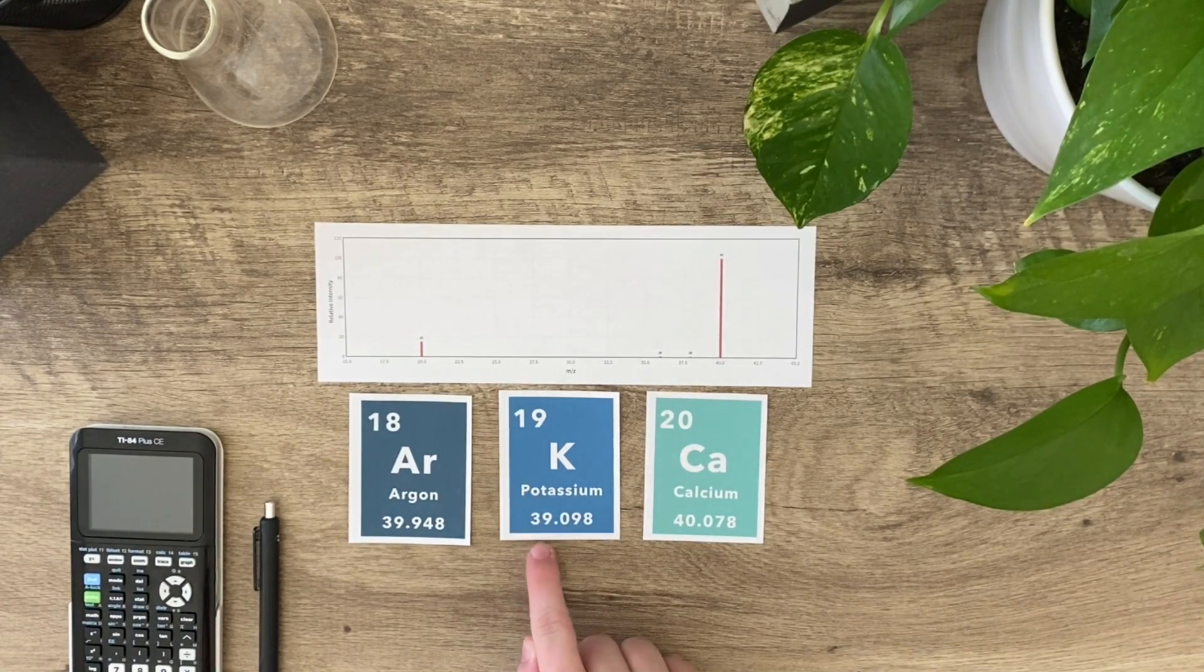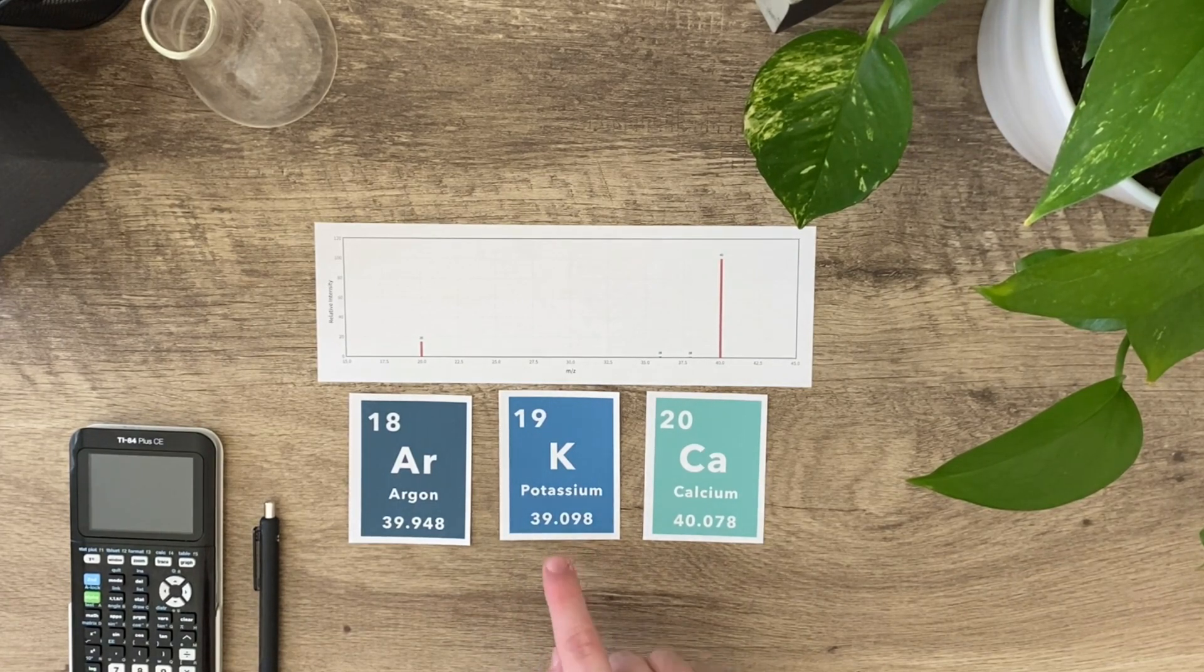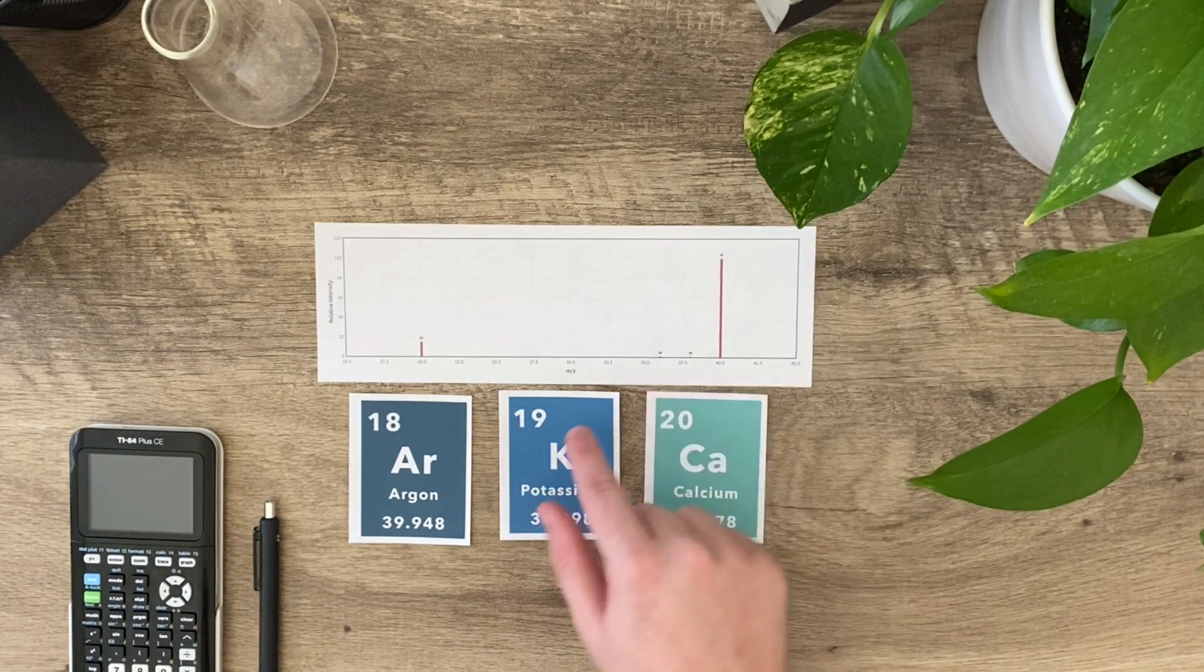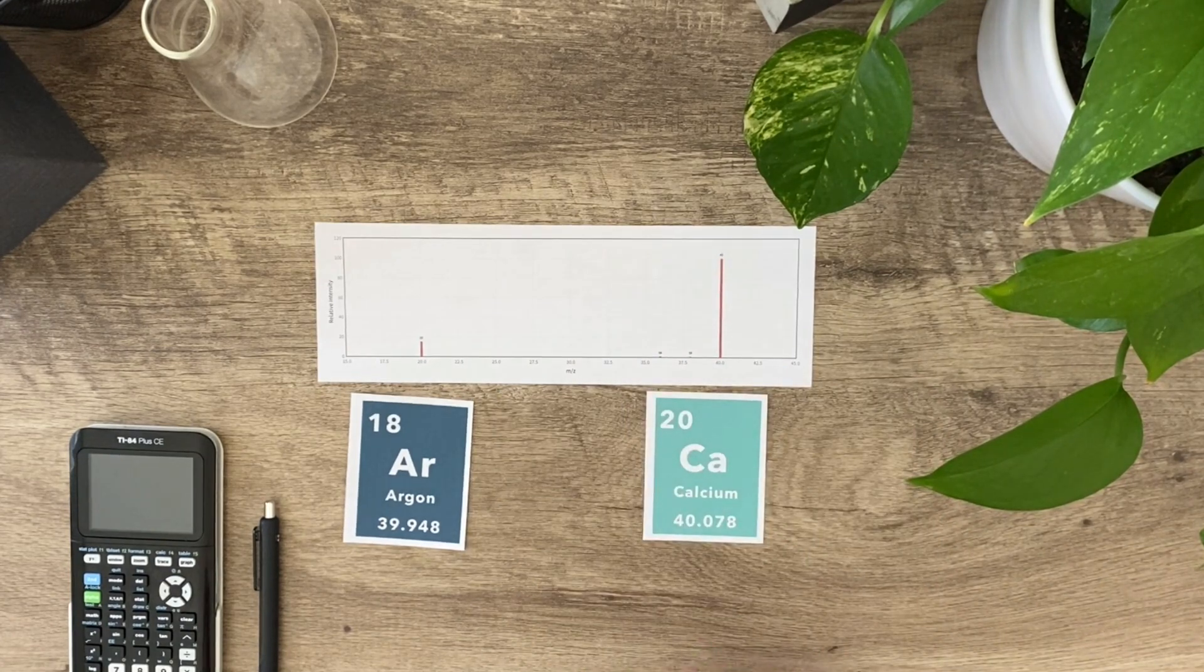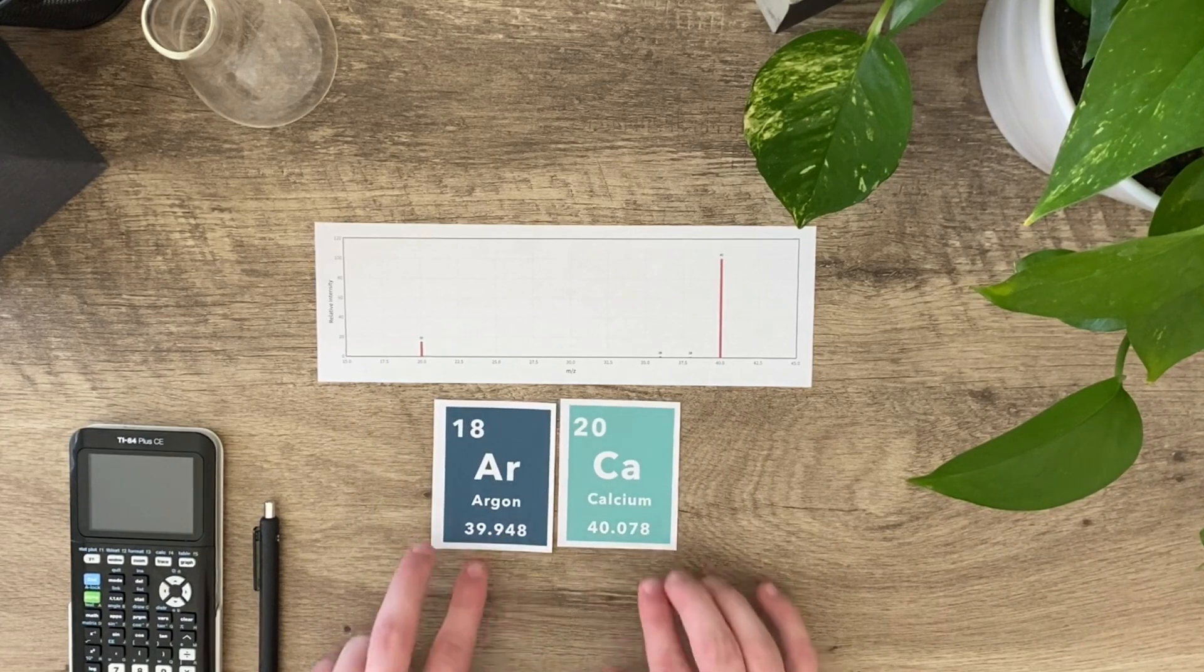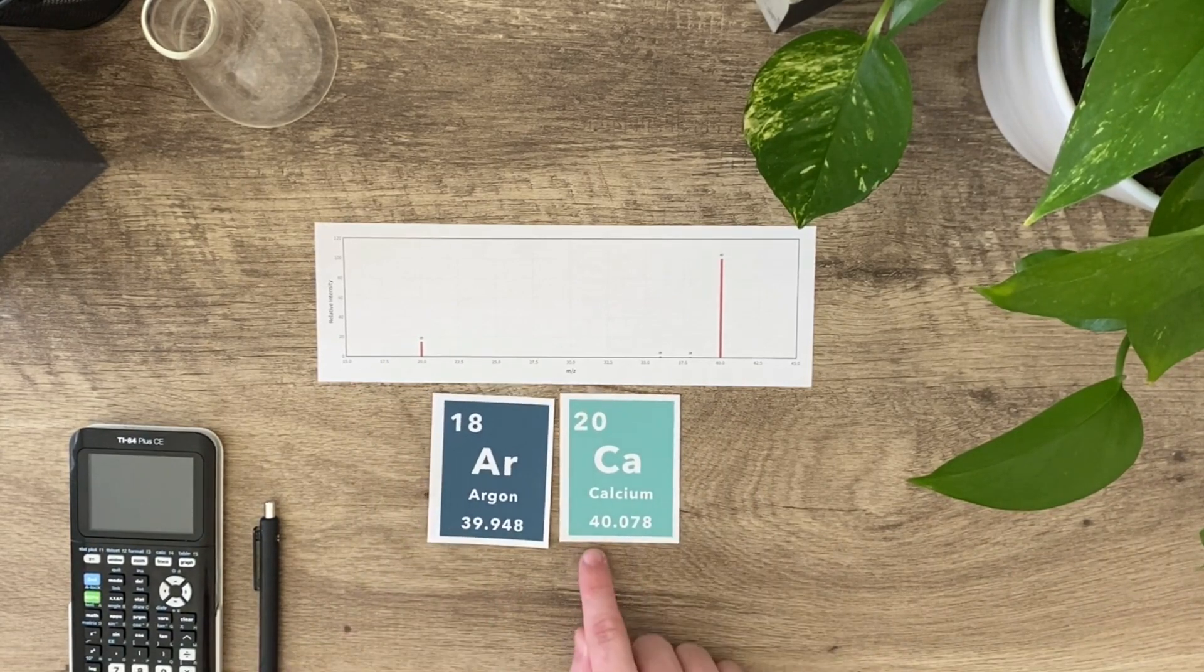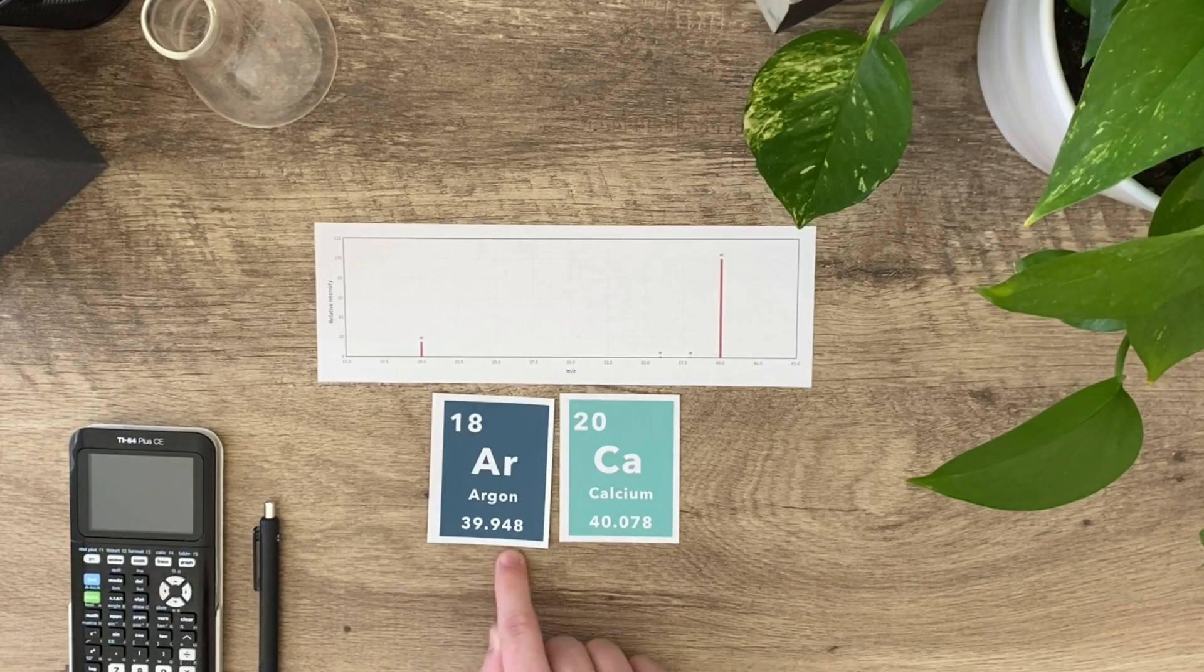The first one we should be able to eliminate really quickly is potassium. Potassium is 39.0, which means I should have a peak at 39, not 40. I have a peak at 40, so potassium is eliminated.